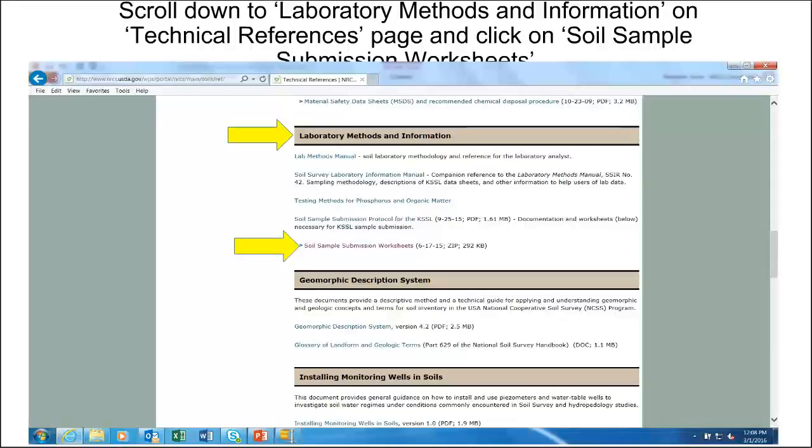And just a clarification on the moist sample thing and shipment, the instruction is pour off the free water, otherwise seal it up. Everybody's nodding their head. Yes, just for those that didn't see that. Yeah. Right. Probably you're not going to have it in the wetland soils. You're not going to have very often many fragments to deal with. Hopefully.